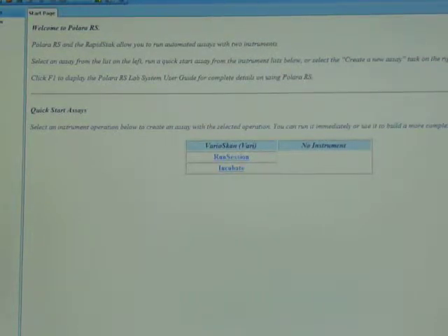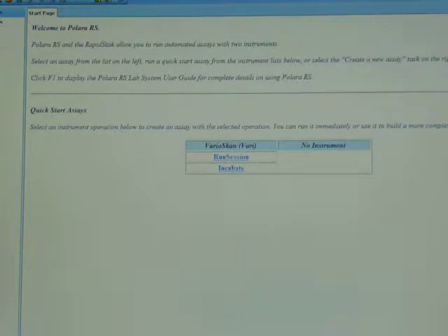Hi, today I'm going to talk about maximizing your VarioScan flash by adding a RapidStack to it.